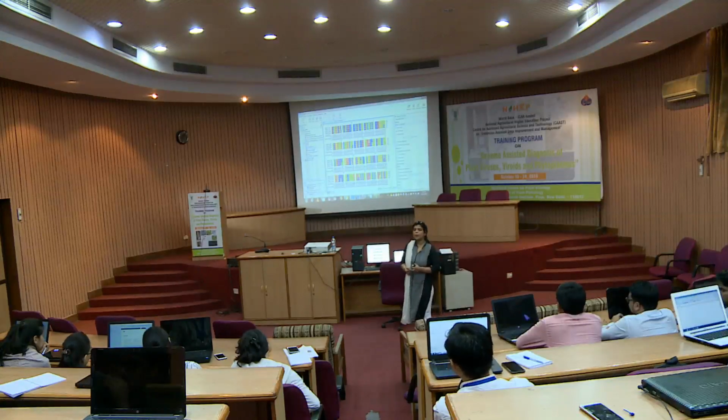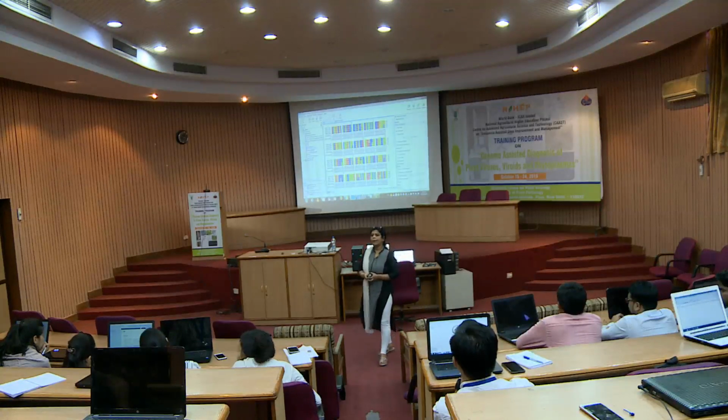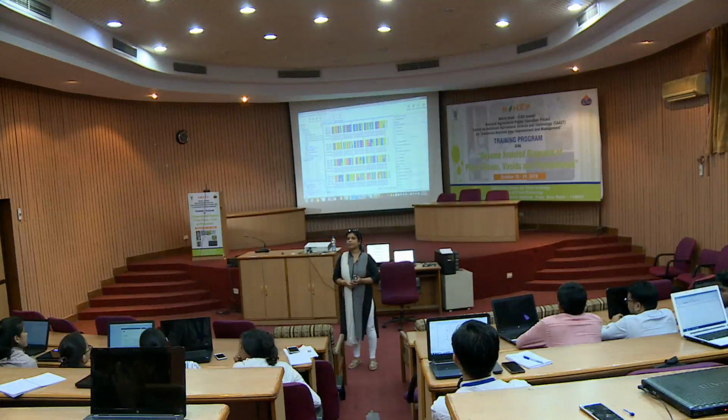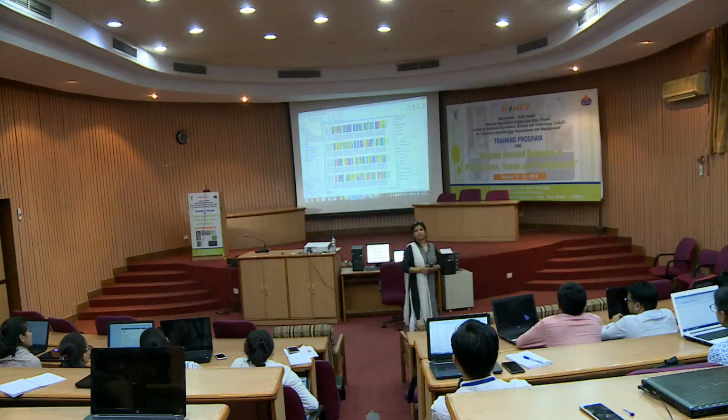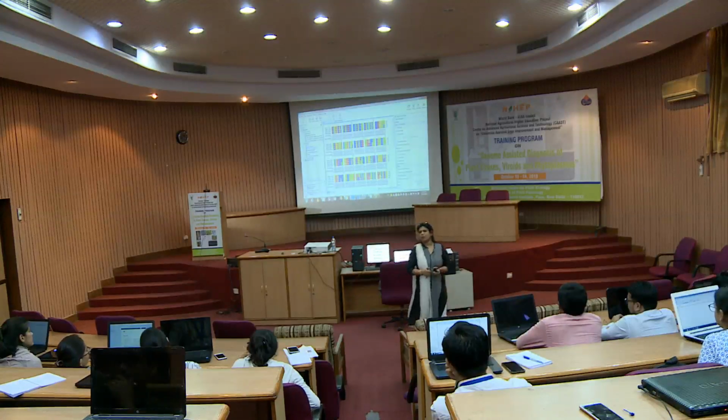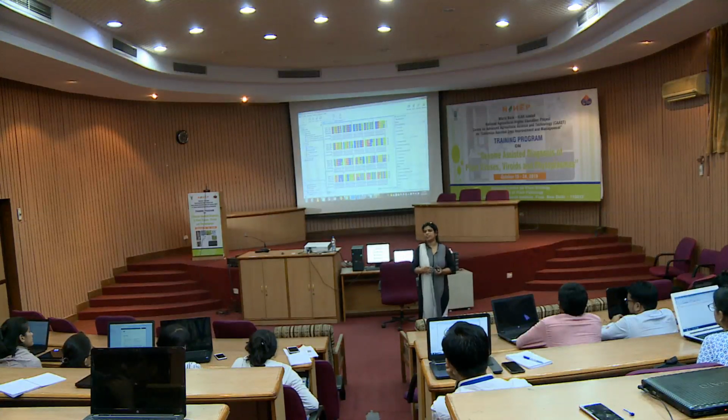Right. Actually, I don't know what that consensus sequence means. Is it similar or not? Consensus is... yeah, and what a contig is. Consensus is actually similar, right?